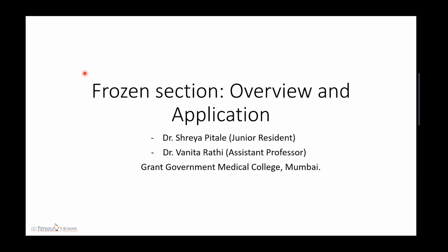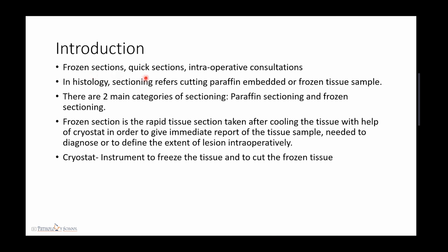Good morning, everyone. Our topic of discussion today is frozen section, its overview and application. Frozen sections are also known as quick sections or intraoperative consultation. In histology, sectioning refers to cutting the paraffin embedded or frozen tissue sample. There are two main categories of sectioning: one is paraffin sectioning and the second is frozen sectioning.